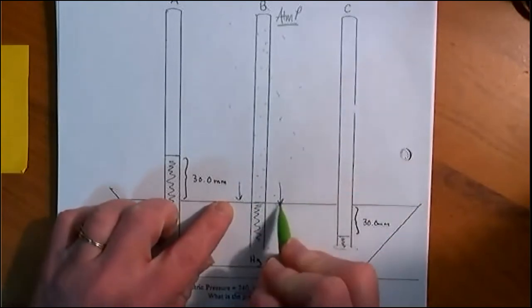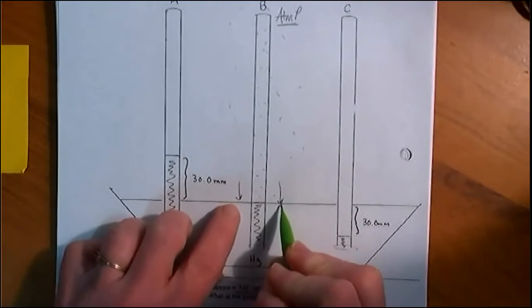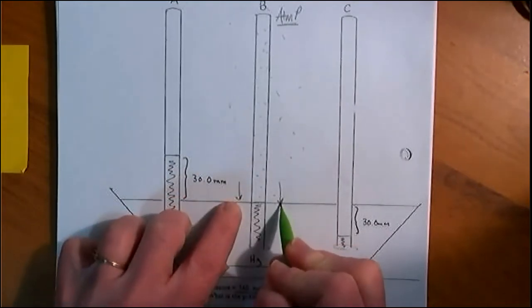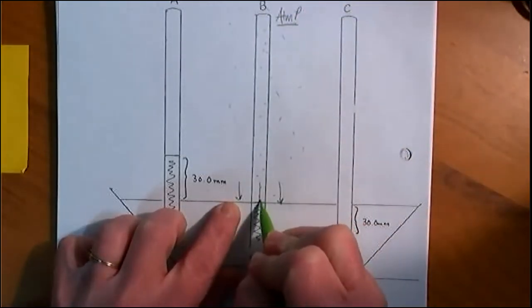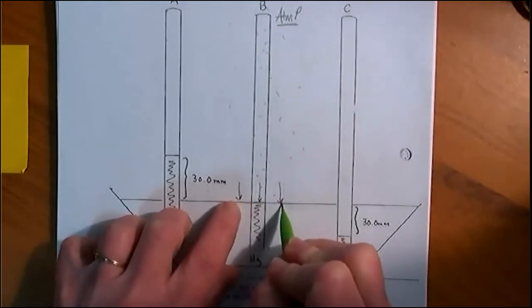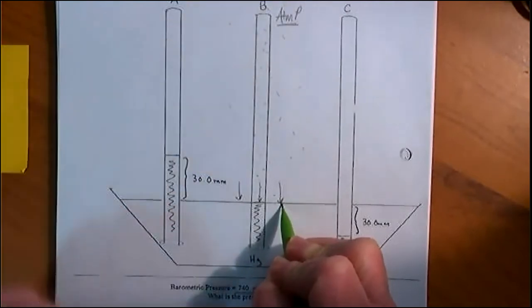Well, if the liquid level is the same on the inside and the outside, imagine the force pushing down. That's pushing on the outside. Well, the gas that you've collected is pushing on the inside.